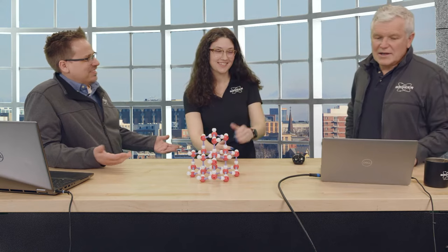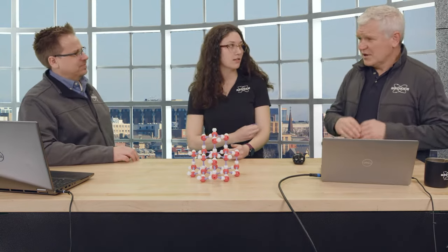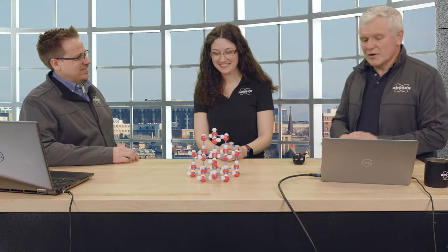Maybe excuse my ignorance on this: what is Jana? I keep hearing Jana. Jana is the program that produced the nice dancing molecule. It's written by Václav Petříček and Michal Dušek in Prague. It's a very sophisticated program. It's the only program, I think, that can do modulated structures. It can also do regular structure refinement, but you would be sort of crazy to use it for a regular structure because it's not very comfortable to use. It's very difficult to use. It's a niche, super powerful tool. It's like you and me sitting in an F1 race car: we would just wreck it. And that's often what you do when you don't have much experience.